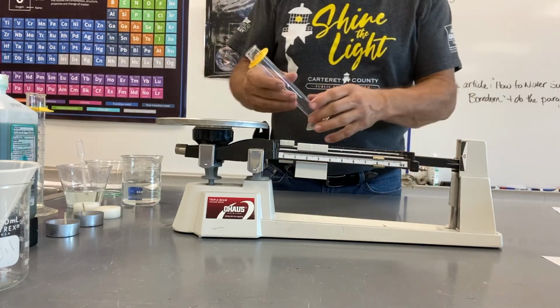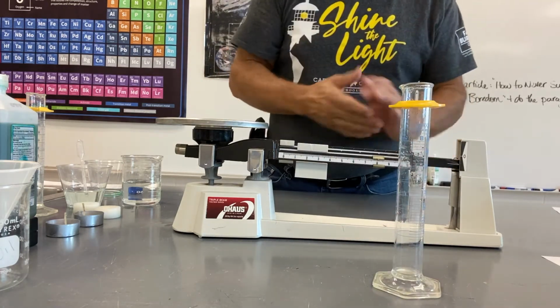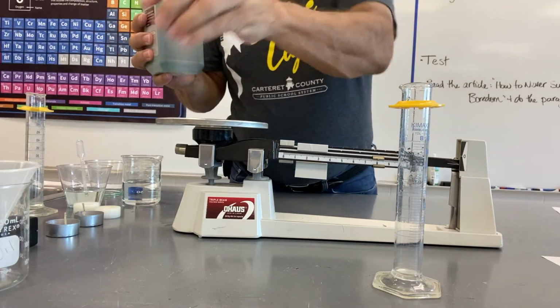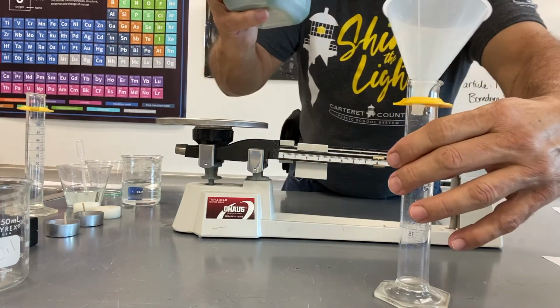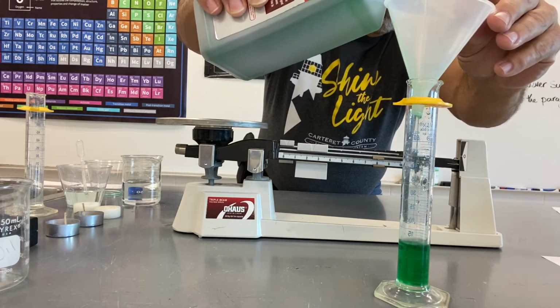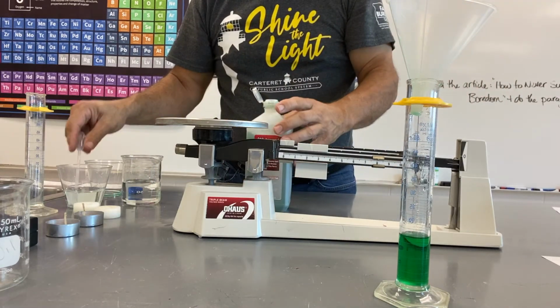Pour the water out of the graduated cylinder. Now we're going to do alcohol, and again looking for 20 milliliters. All right, and I'm going to take it up the rest of the way with the pipette.